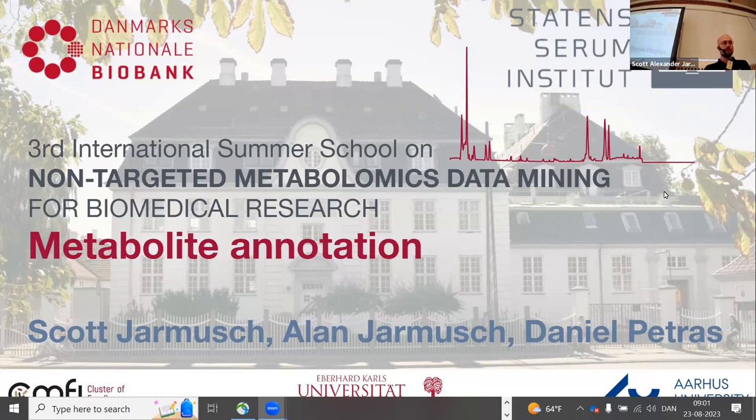So this first session, we'll talk about metabolite annotation. It's important to know that you have good quality data. It's important to know that your pre-processing is doing a good job picking your peaks, but you ultimately want to know potentially what's in your data. And that's how any of us add some context to some of the work we do.